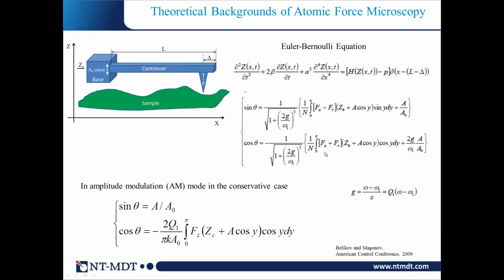And depending on what kind of force, mechanical or electrostatic, that gives us a mechanism to look at the basics of the interaction, and how we can describe the cantilever behavior, how we can extract information about the tip-sample interaction from learning about the phase of the probe, about the change of the amplitude, and so on. That basis also gave us a chance to look at the different modes with a more systematic view.